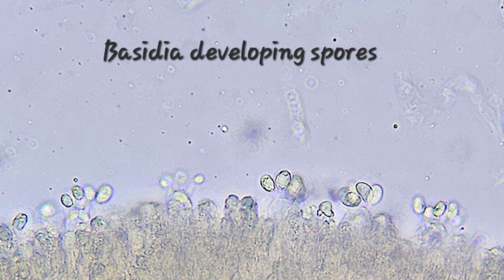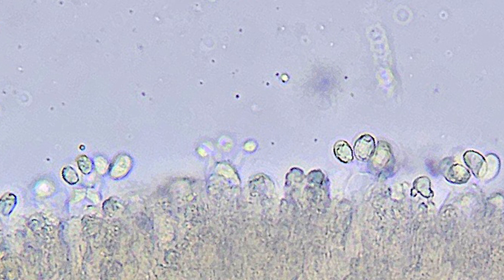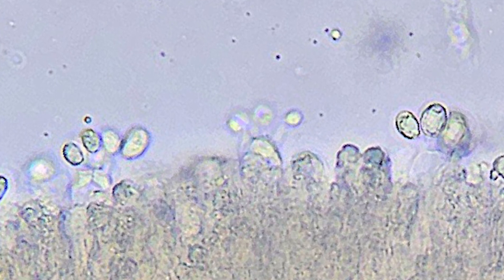I'm going to look at this picture — it says basidia developing spores. Those little balloons that look like they're floating there: if we zoom in, you start to see the little structure just beneath it, and there are little arms coming off of that structure. That structure is called a basidium — that's the singular for basidia, which is plural. There are those little arms extending out with the little spore structures starting to grow on them. Some of them are very young in the background; you can see some really undeveloped spores, and up in the foreground some much more developed spores. Those little arms are called sterigmata or sterigma — each one is called a sterigma, but in plural we say sterigmata.